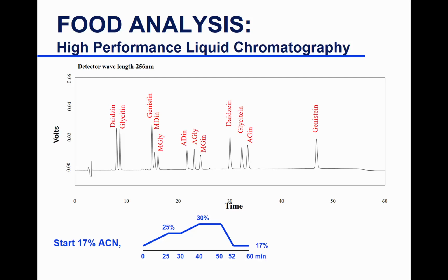It will take forever, I tell you. It's just going to go on and on and on. And not only that, you're going to get broadening of the peaks. And if you get broadening of the peaks, those 3 peaks that you have here will co-elute. It will just be one very broad peak. So no, you don't want to do that in this case.